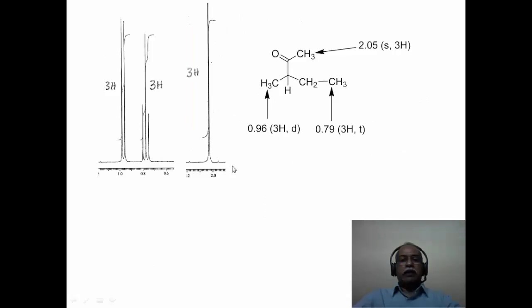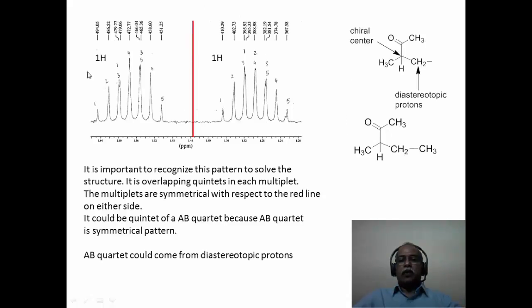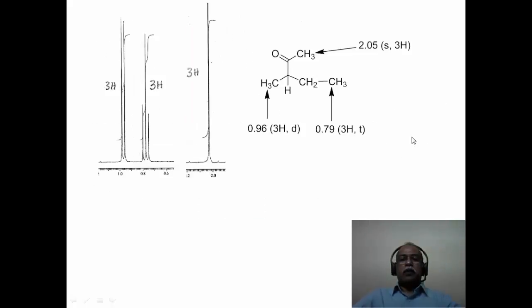Then you have a 3 hydrogen intensity signal which is specified here. Now this structure is more or less confirmed from the fact that you have this pattern, which would only correspond to a CH3 group being attached, and this of course corresponds to the molecular formula C6H12O and takes care of the molecular formula also. So one can now easily assign the rest of the multiplets. This particular hydrogen will split this methyl into a doublet.